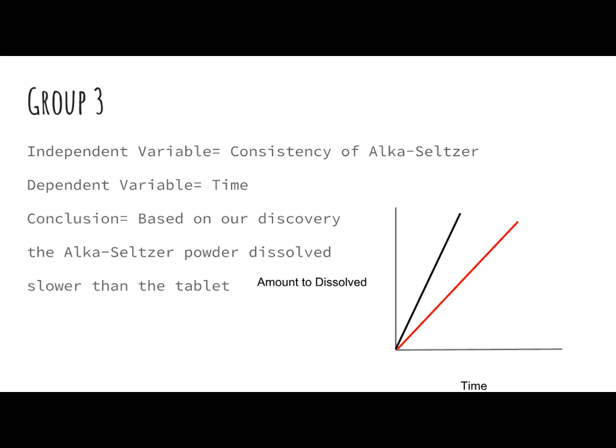Okay. Somebody else? The surface area? Right, so what we're trying to see is how does surface area impact rate of reaction? So theoretically, how should surface area impact rate of reaction? The more surface area you have, the increased reaction. Yeah, so more surface area, increased rate of reaction, right?